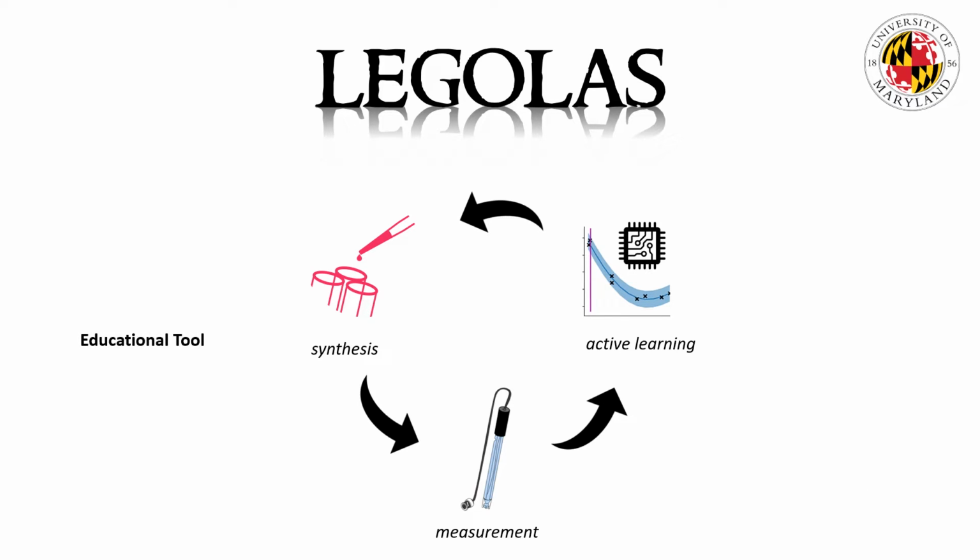LEGOLAS can be used as an educational tool. It is low cost, can be used to teach about robotics, autonomous experimentation and systems, machine learning, and specifically active learning, and experimental design setup.